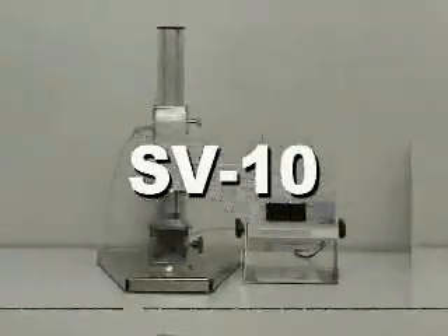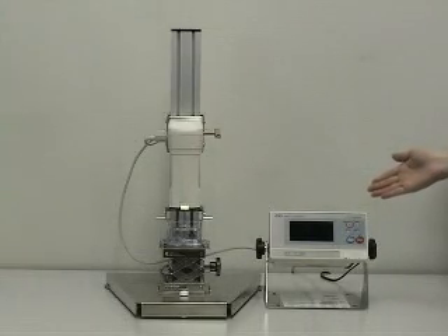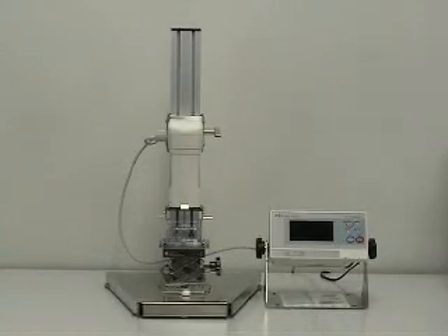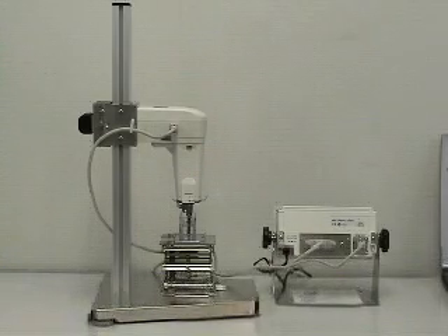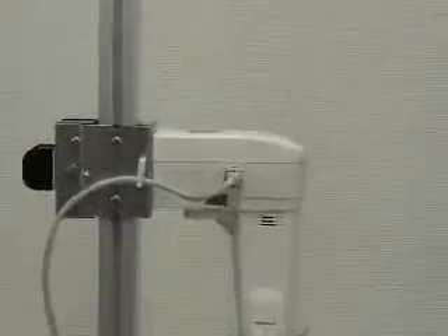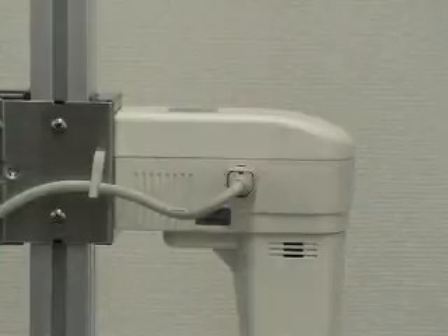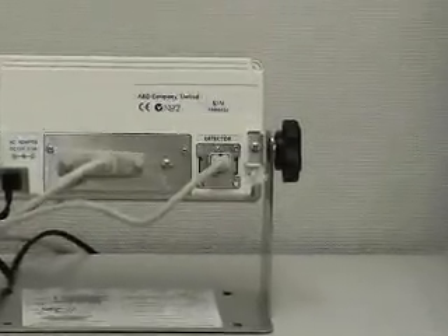SineWave Fibre Fiscometer SV10. The SV10 is composed of a main unit and a display unit. The main unit and the display unit are connected by a connection cable and have been adjusted as one set. For accurate viscosity measurement, confirm that the main unit and the display unit carry the same serial number before use.